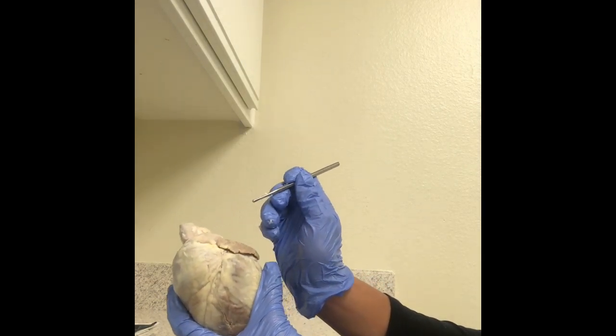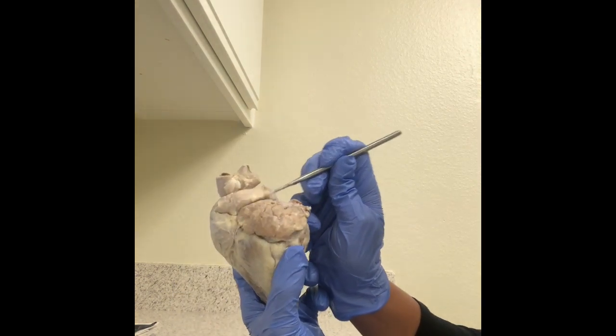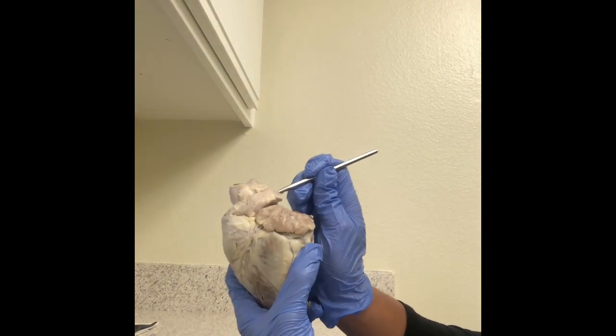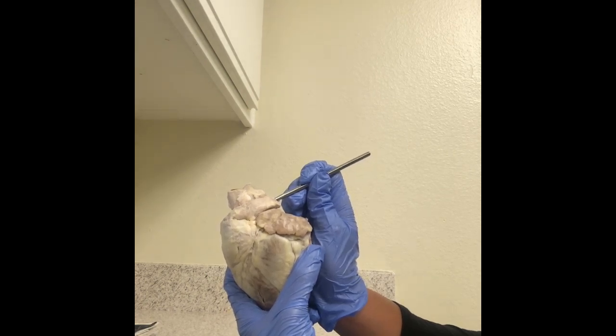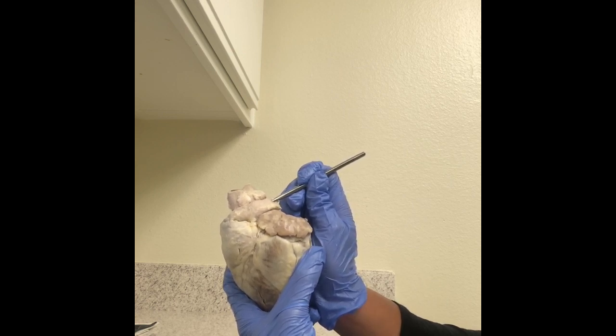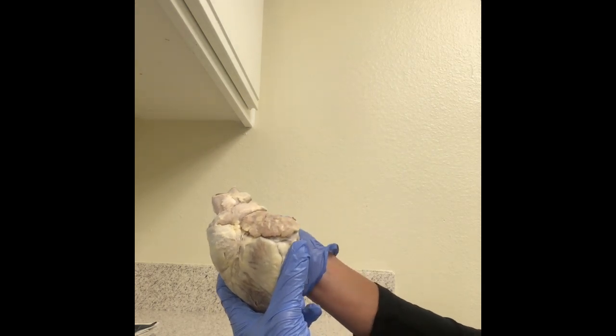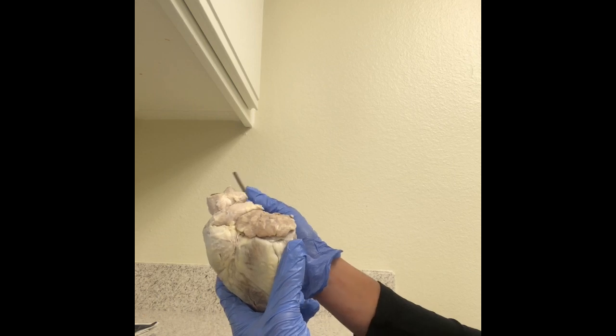We also have pulmonary arteries. So the pulmonary arteries are right here. The pulmonary artery carries deoxygenated blood from the right ventricle to the lungs. The blood here passes through the capillaries adjacent to the alveoli and becomes oxygenated as part of the process of respiration. In contrast to the pulmonary arteries, the bronchial arteries supply nutrition to the lungs themselves.